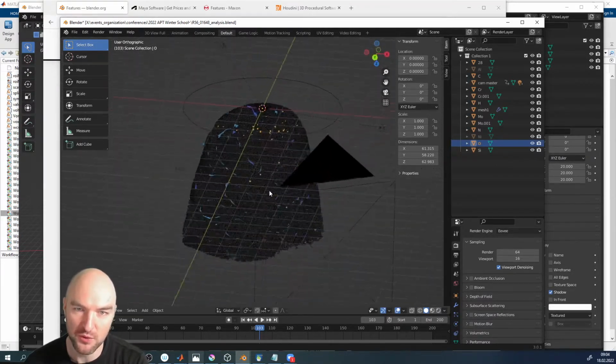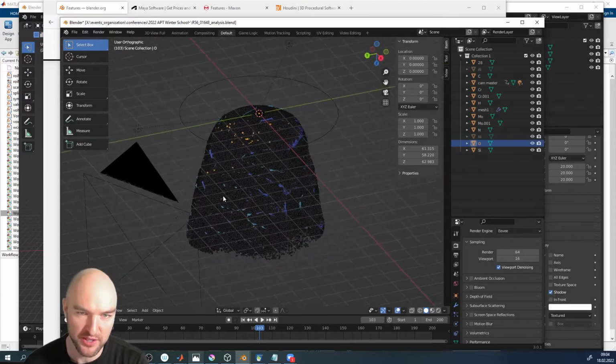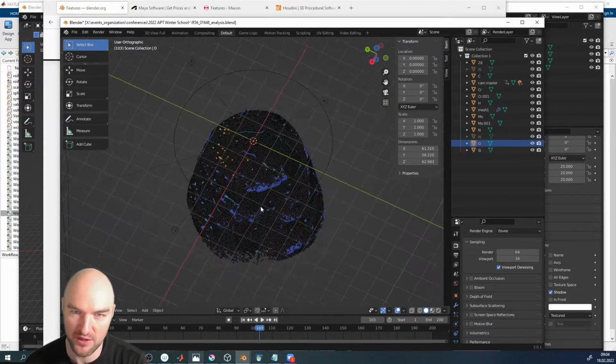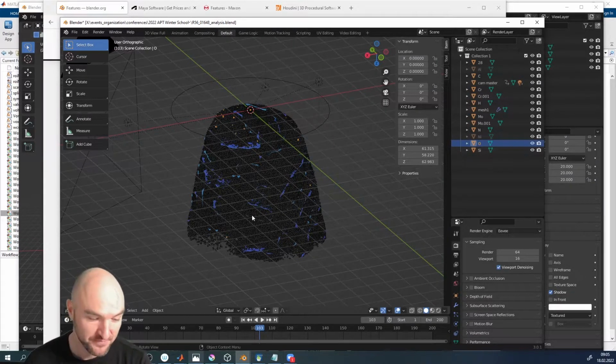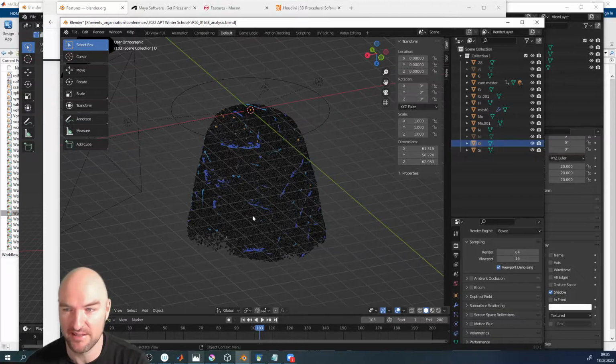the way we do that is we create some iso-concentration surfaces or iso-density surface, some kind of iso surface, and then we base our analysis on this iso surface. This obviously has one downside, and that is not every object is outlined by an iso surface, and even if it is, sometimes the iso surface suffers from the fact that underlying is actually a histogram.